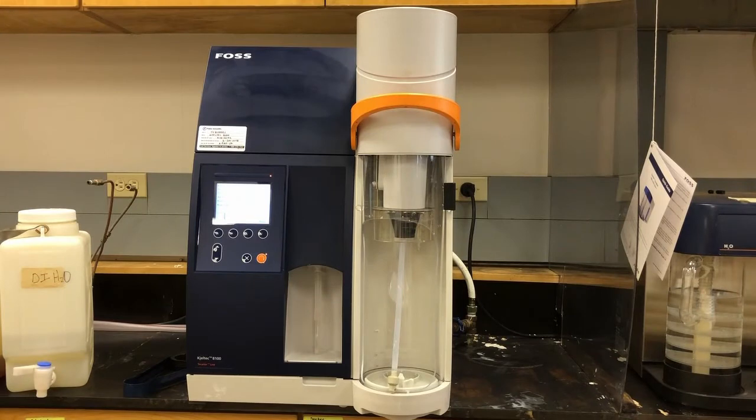So now that our samples are digested and cooled down, we're ready to start the distillation. This is an automatic distillation unit. Inside this machine, what you can't see, there is a heating coil which heats water to produce steam, and a condenser as well. So we heat the sample, which liberates the ammonia, and then it is distilled by steam for about 5 to 7 minutes through a condenser, and then the ammonia is collected in the receiving flask.